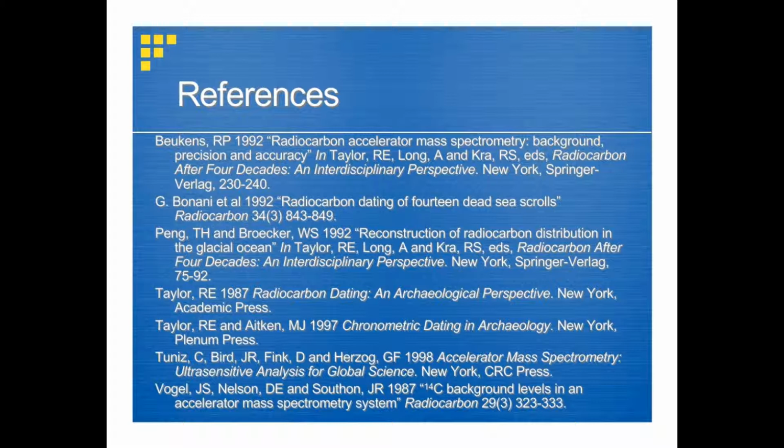First of all, this is a tandem accelerator. Negative ions are injected into the machine. They are stripped at a terminal in the center of the accelerator. So you go in with carbon -1. You strip it to carbon +3 typically. And that stripping process kills all of the molecular ions. They don't survive it. So what comes out are just atomic species.